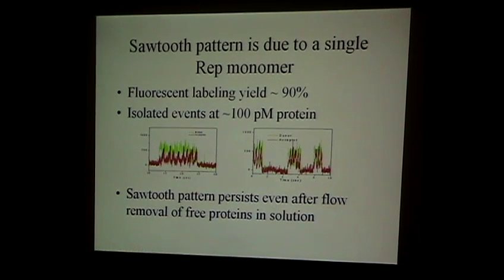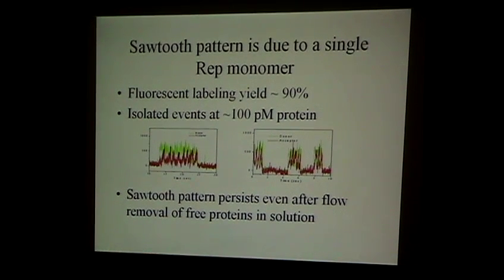So in fact, we can also put the dyes on the DNA, the beginning and end of the DNA track, donor and acceptor instead, and then show that you see these brief moments when the signal goes up, indicating that a loop is being formed every time you make these snapback events.